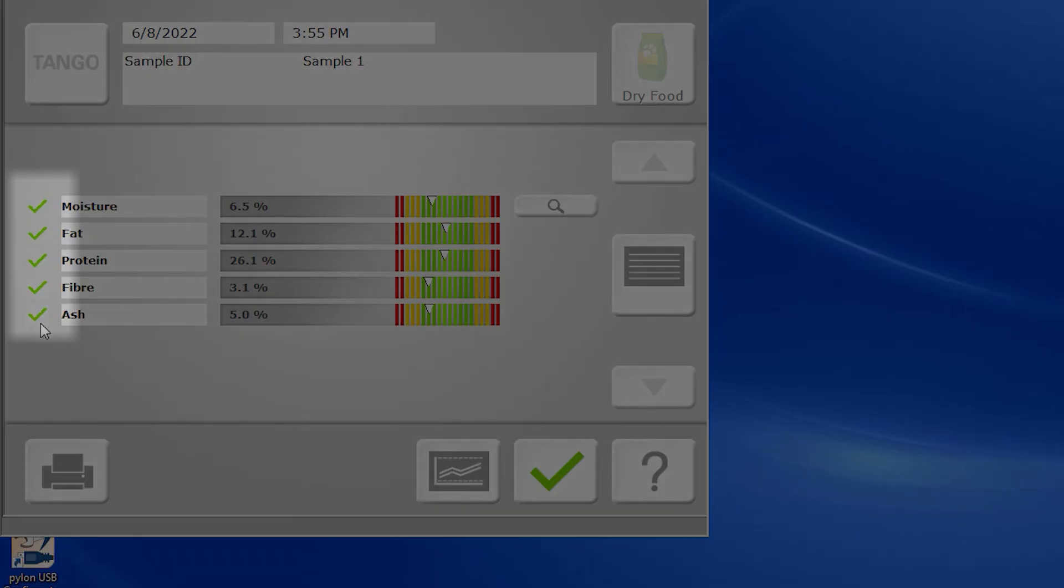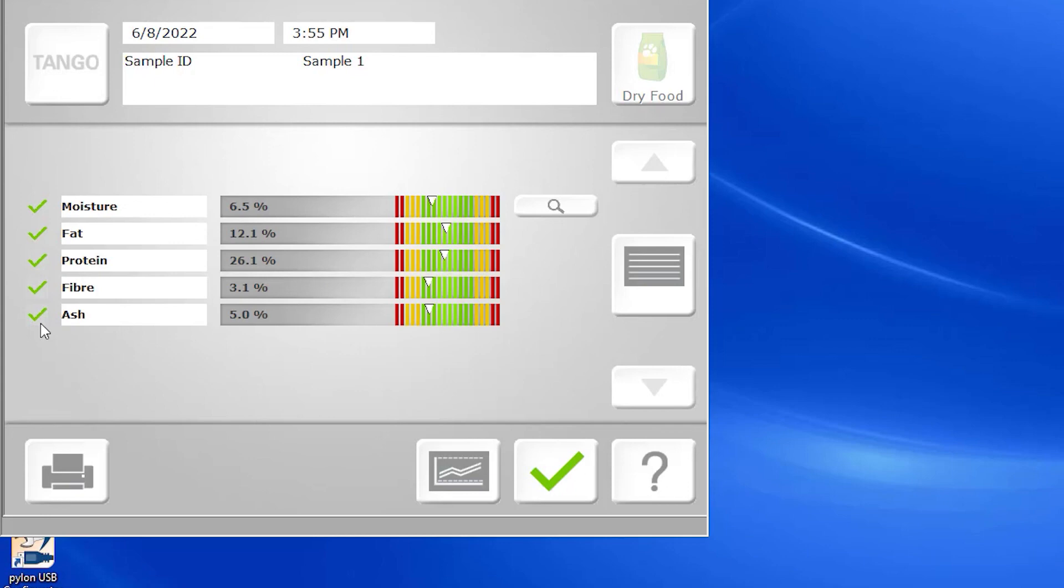The green check mark to the left of each constituent indicates that the measurement falls within the concentration range of each analysis, as well as within certain statistical thresholds based on the analysis being performed.